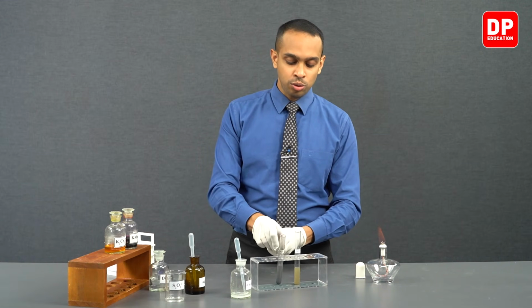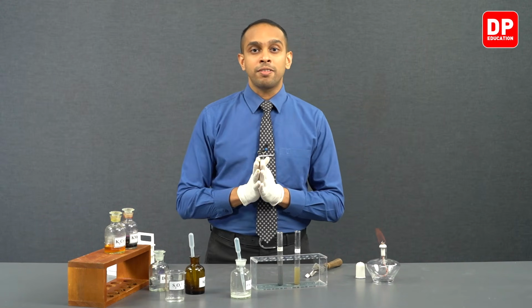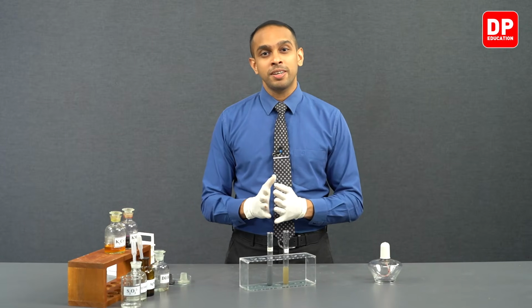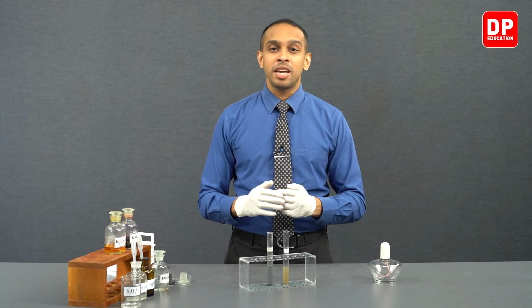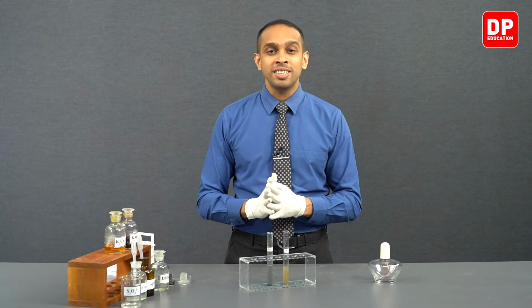Now, let's go over the methods that we used to identify the presence of thiosulfate ions. First test we did was taking a sample of thiosulfate ions and reacting it with a mineral acid such as hydrochloric acid. When we add hydrochloric acid to a thiosulfate ion solution, we observed the formation of solid sulfur and sulfur dioxide. The formation of solid sulfur was clearly visible because solid sulfur, when it is getting formed in aqueous medium, will be formed as a white color or yellowish white color precipitate.